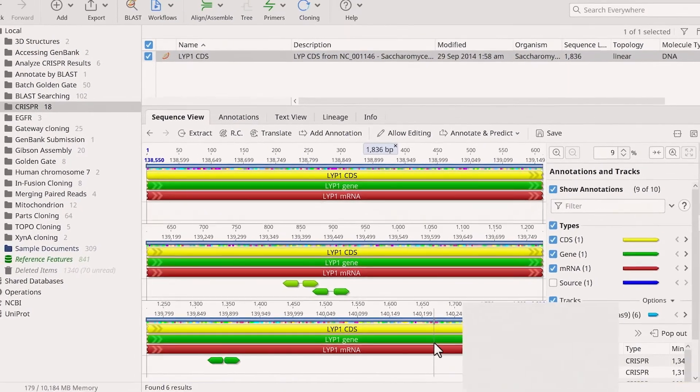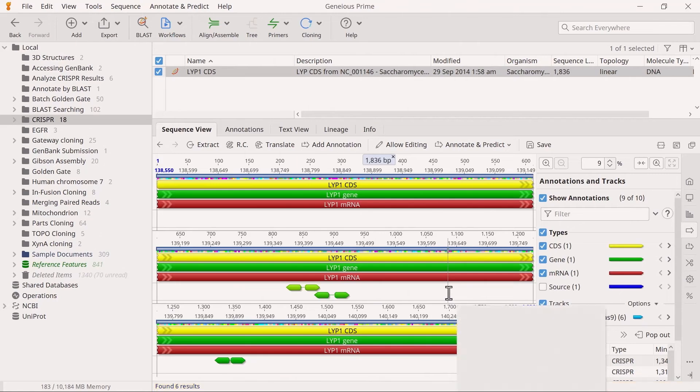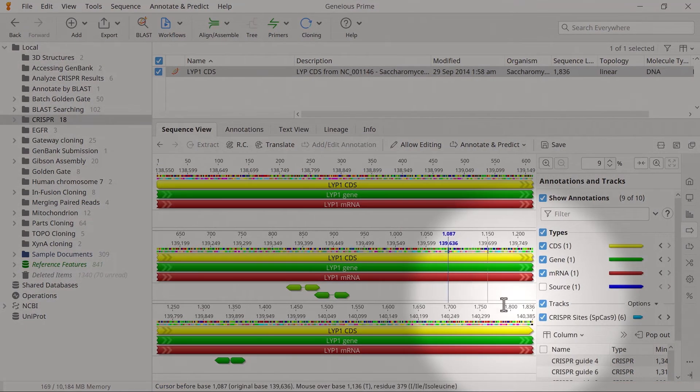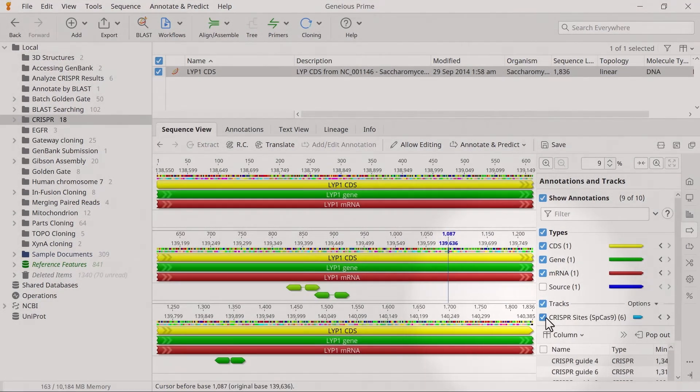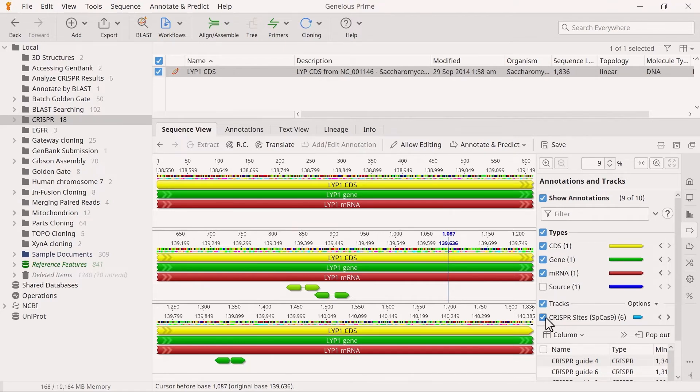After the analysis has run, you should see the CRISPR sites track added to your sequence. On this track, Genius will only annotate sites if they have at least one pair conforming to the maximum overlap and maximum space between sites settings. Sites with no pair within these settings do not have annotations.